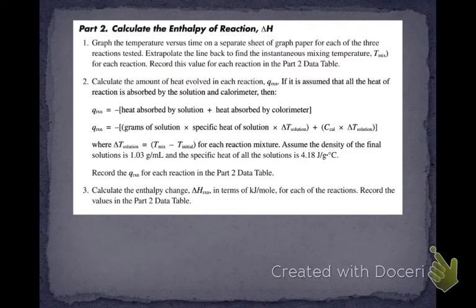That works for me. If you want to take a screenshot of the graph that was given to you for the calorimeter section in part 1, you just want to make sure that if you screenshot that, you have to change the temperatures. The time axis can stay the same because it's over 3 minutes, but your temperatures would have to be changed to the correct temperature range. So there's lots of ways that you can prepare a graph. You can use the graph paper in Notability and just do it right in Notability if that's how you're writing your lab report. Again, I'm going to kind of leave that up to you, but just make sure that you have the graphs in there because that is part of the lab report.